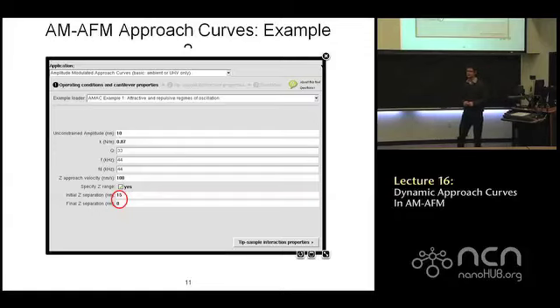Okay. I think everybody has something either correct or very close to being right, so good enough for government work, right? How do you know when it's close to being right and when it's right? Qualitatively, I've seen the basic features I was looking for: jumps in the attractive and repulsive regime and a snap-in. Some of them look like they're having a slightly different amplitude ratio, so I think somebody has a parameter slightly different, but I think it's okay.